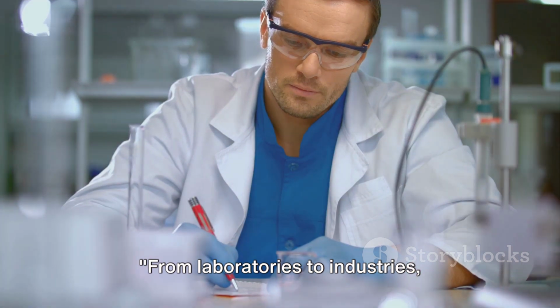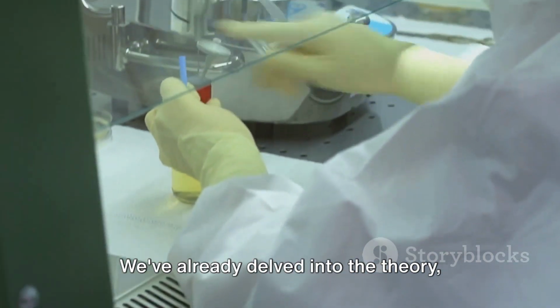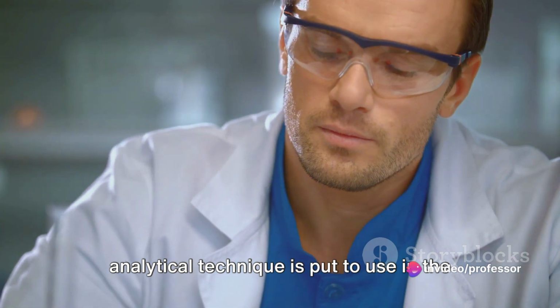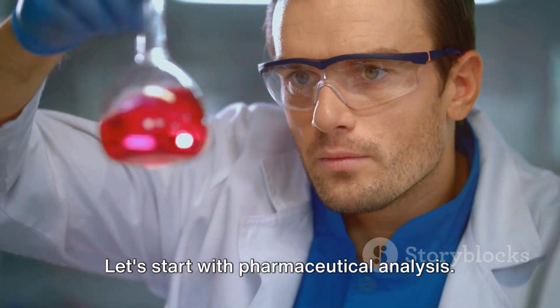From laboratories to industries, coulometry has a wide range of applications. We've already delved into the theory, principles, and types of coulometry, and now it's time to see how this potent analytical technique is put to use in the real world. Let's start with pharmaceutical analysis.